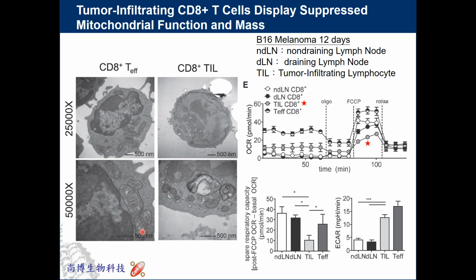So you can see if mitochondria is in a fusion state, it is a good mitochondria. And here, a mitochondria is fissioned to a very small part. So it is very obvious. This mitochondria function sucks. So let's try to do a Seahorse analyzer.